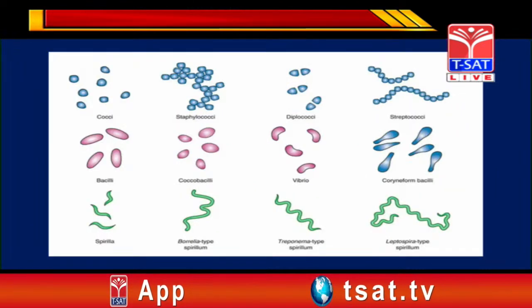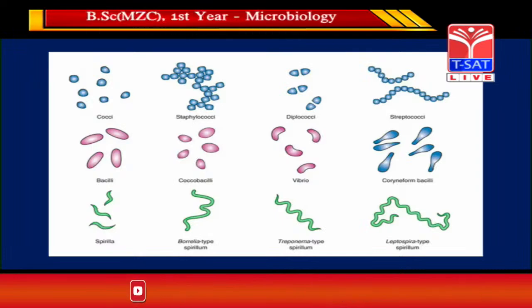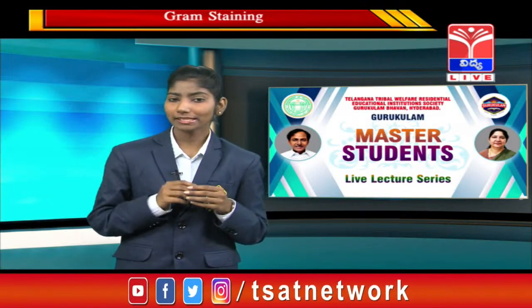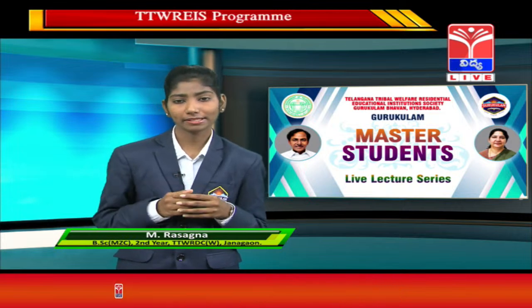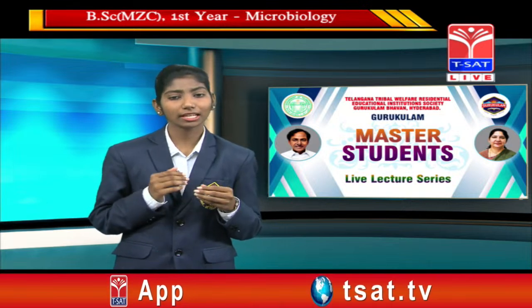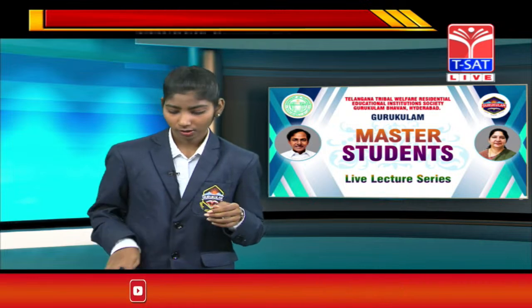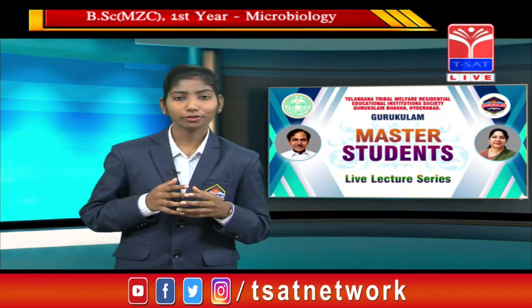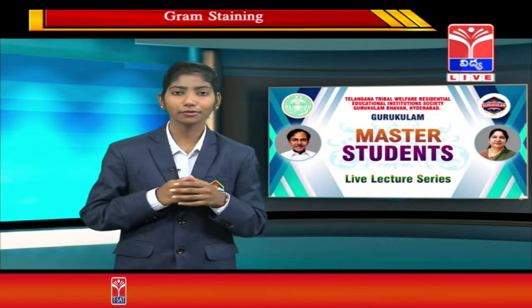So, these are the different types of bacteria based on arrangement. It can be divided into 4 different types in cocci. In bacilli, it is also present in different types. And in spirillum also, the bacteria which exist in spiral shape are known as spirillum. So, then it is the importance of staining. It is also helpful for the detection of cells.